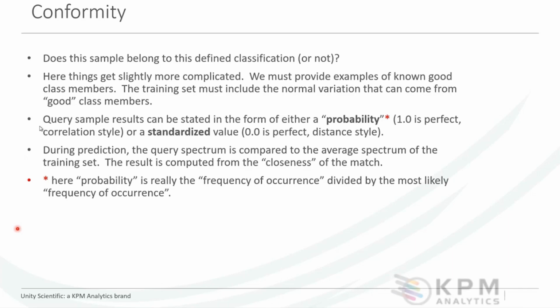But one of the things they wanted to know was, did my bakery mix in powder form look like it was supposed to? Did it have all of the right ingredients so that I can be reasonably sure that when I run through my entire production and I make my rolls at the end of this, that they are going to be a high quality product.